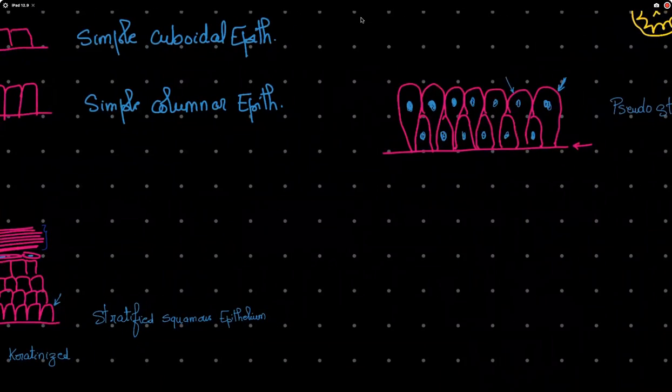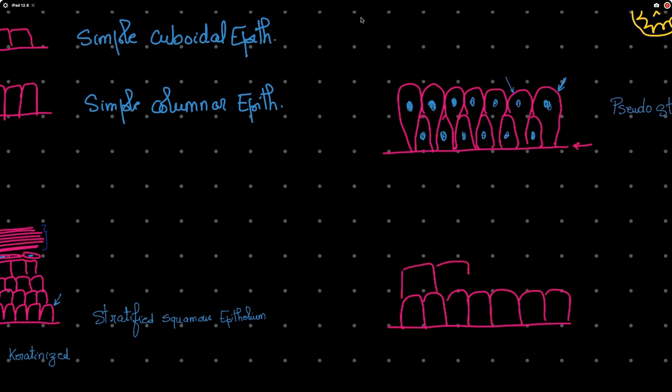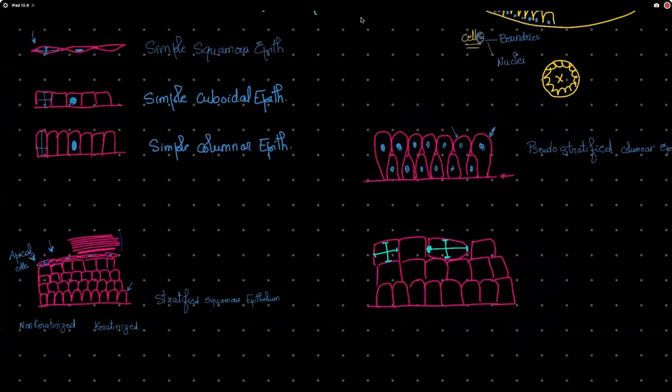One last type of epithelium that we've seen was formed by more than one cell layer. Some of the apical cells were cuboidal. And how did I figure out that those are cuboidal? I check the height of the cell and compare it to the width of the cell. They are almost equal. And see on here, another cell, it's much wider than it is long. So some cells are cuboidal, some cells are squamous.